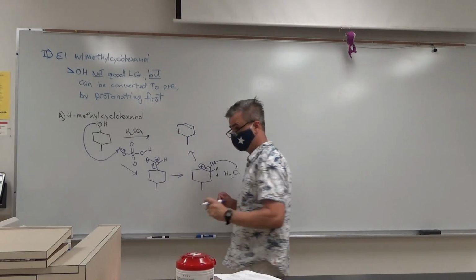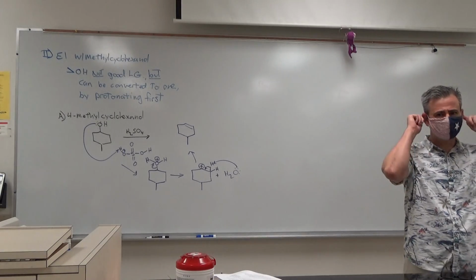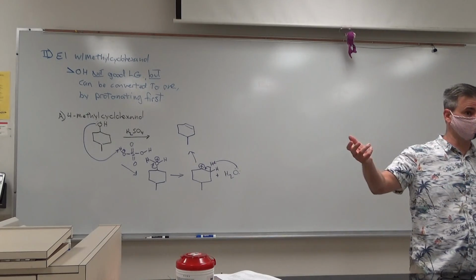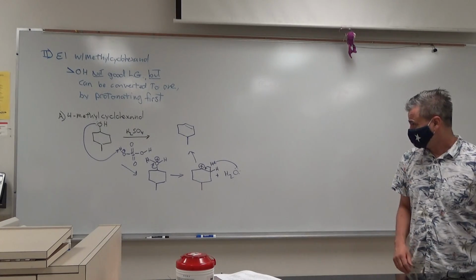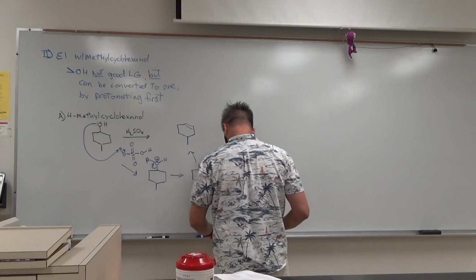And this is another 2-week experiment, by the way. In this 2-week experiment, it's good to pay a little bit of attention to the names, because we've got a whole bunch of different products and molecules and starting materials that have semi-similar sounding names. So we started with 4-methylcyclohexanol.